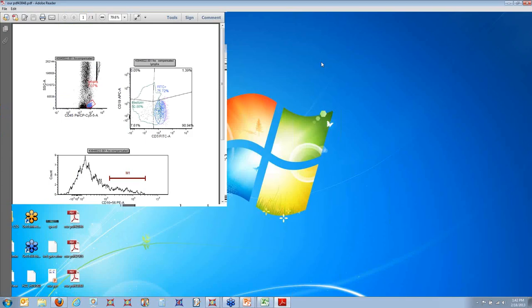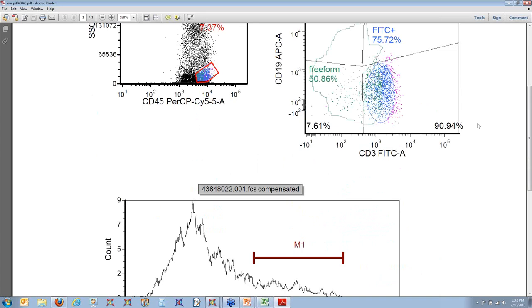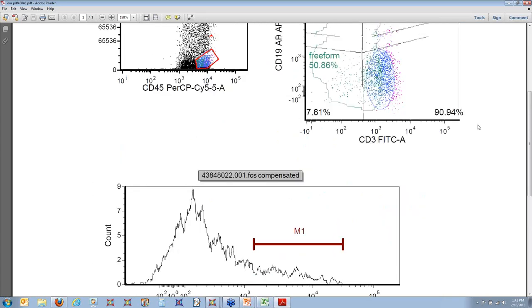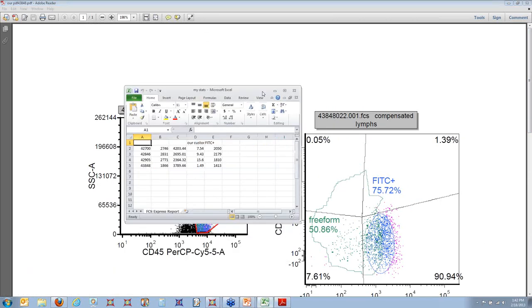So this is one of the PDFs, and you can see that it came through at very high resolution, okay? And I'm scrolling down, and of course those background images didn't come through because this is really just a printing program where things on the page proper come through, okay? And lastly, this is our Excel spreadsheet that we made.